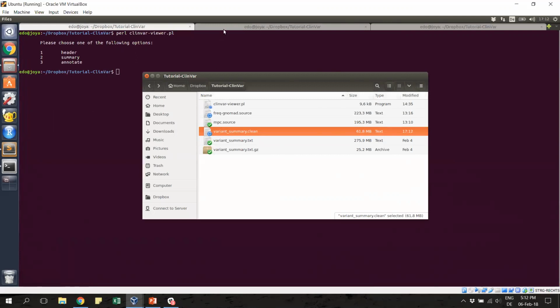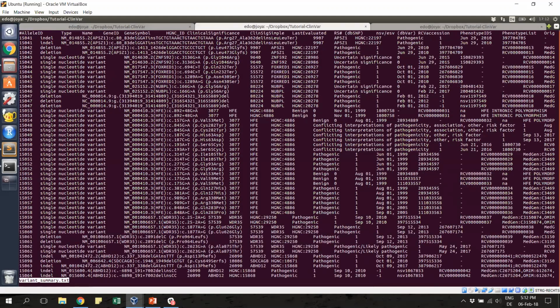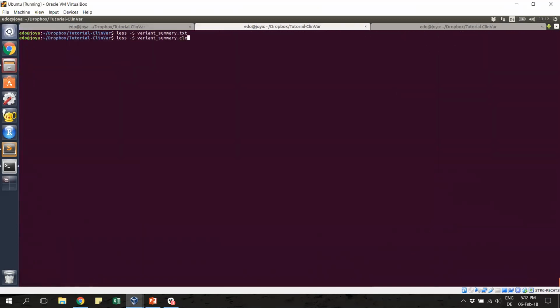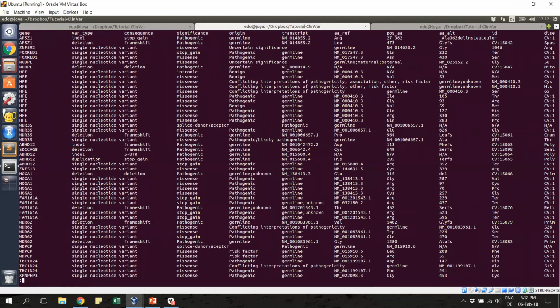This variant clean looks like this. So first, I'm going to show you how the bulk database looks. These are around 30 fields, so it's really hard to read. But when we move to the just-created variant clean analysis, we can immediately detect which type of variant we are talking about. So now we have genes, type of variants, and molecular consequence.